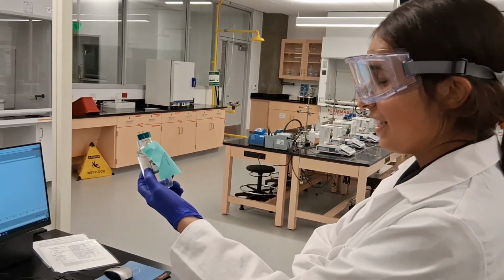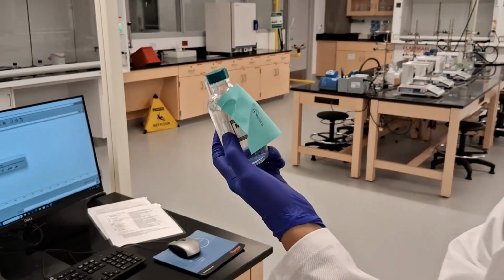Gee, I have no idea what this is. I guess I gotta use IR.